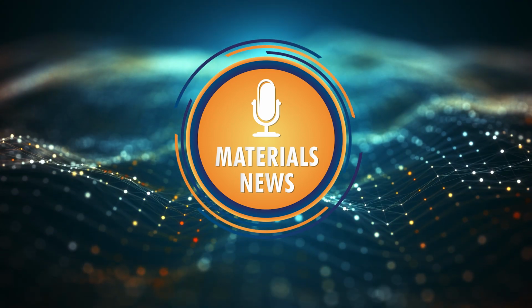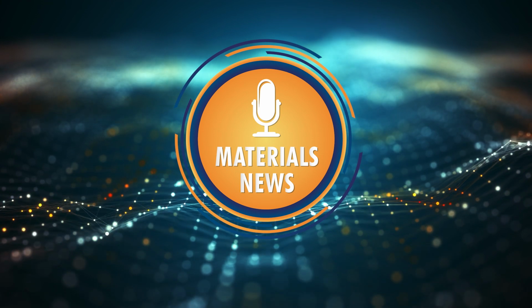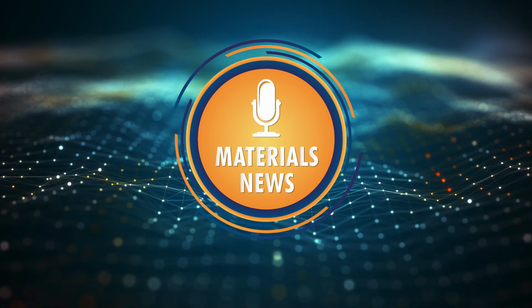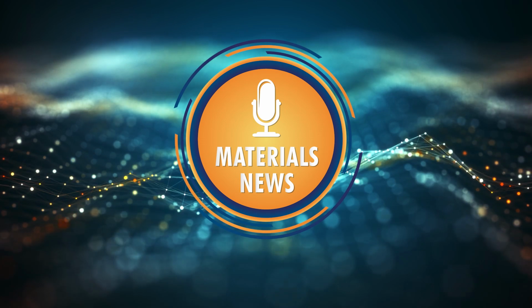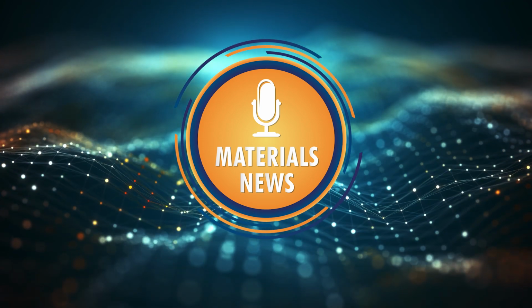computer operating system. The new algorithms feed into a visualizer to build up a 3D image that evolves in real time, becoming more detailed as the experiment progresses. And this isn't just surface rendering like a Shrek movie. This is full volume where every voxel in this 3D cube has to be assigned transparency and color values. So we had a platform, an open source platform that could do that, but it couldn't do it dynamically.